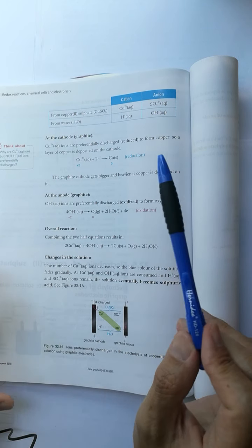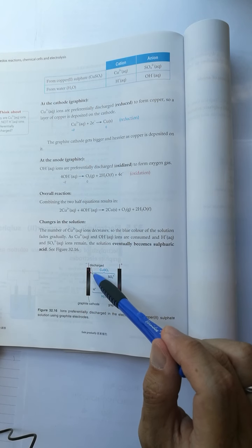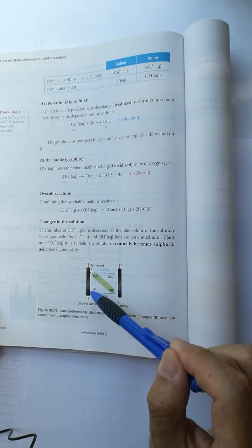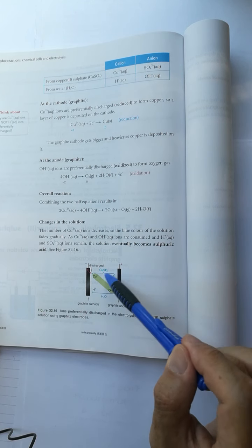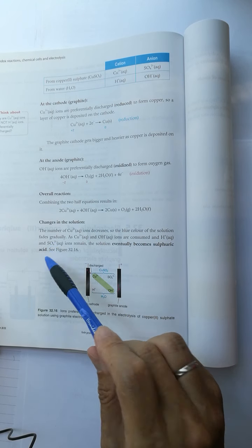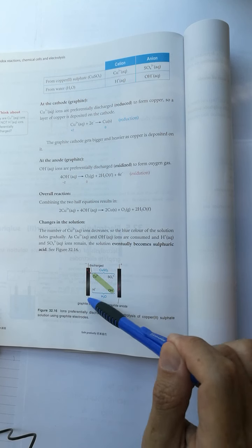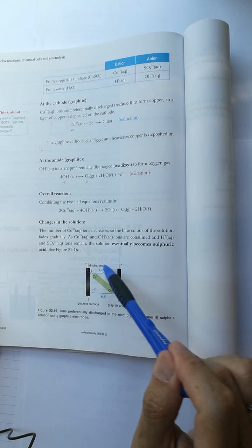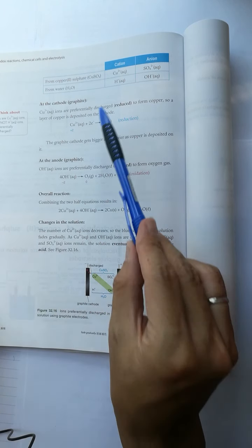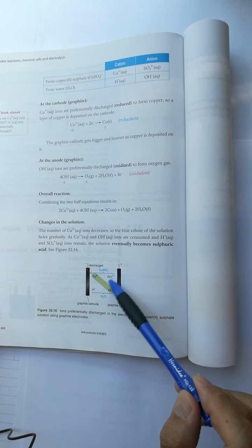Looking at the solution, the copper(II) ion and hydroxide ion are discharged, so what's left behind is hydrogen ion and sulfate ion—sulfuric acid. The change is from copper(II) sulfate solution to sulfuric acid.